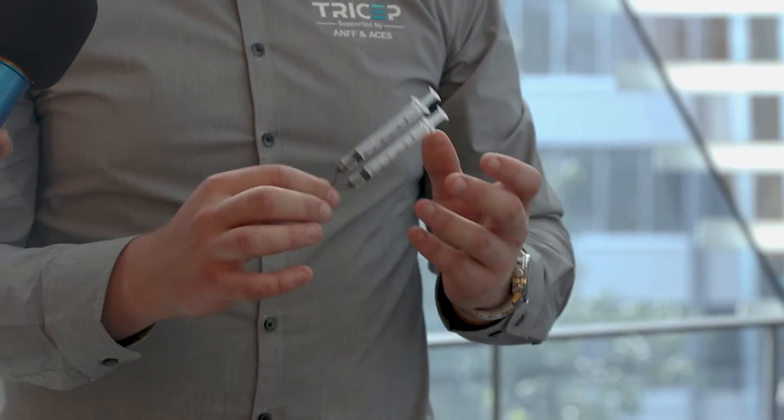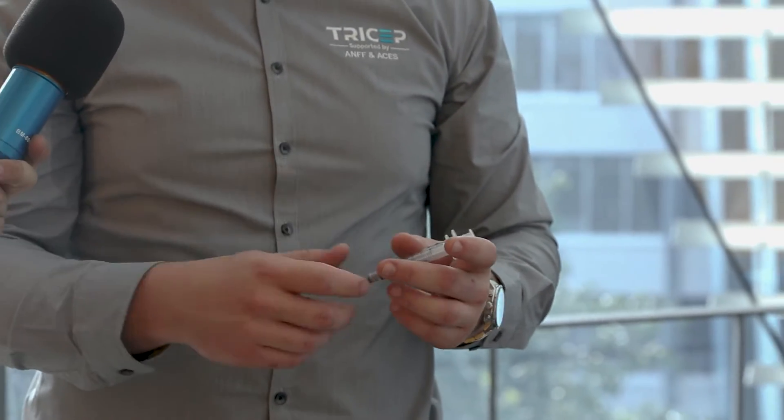We put the coaxial nozzles into bioprinters and formulate the ink from natural substances like gelatin, adding a couple of functional groups to allow us to print out a softer gel that can be implanted directly into the body. That particular project is for cartilage regeneration — it gets printed into the knee, then we UV cure it to increase the modulus of the material and make it stiffer, allowing regeneration of cartilage to happen.